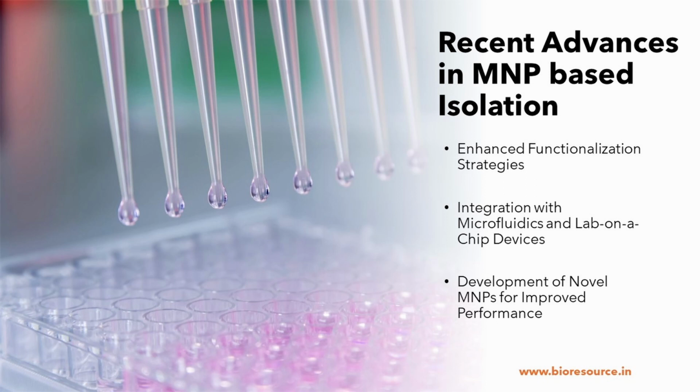Certain examples include isolation of cell-free DNA. If you want to target certain pieces of information from the complex sample matrix, we can use specific oligoprobes attached to the MNP, which can capture the low abundant sequence and concentrate it instead of capturing the total DNA. Multifunctional coatings: MNPs are being designed with multifunctional coatings, and these coatings can combine functionalities like targeting molecules, spacer molecules to optimize the binding distance, and responsive moieties for controlled release of the captured nucleic acid. This allows for tailored MNPs with improved performance for specific applications.